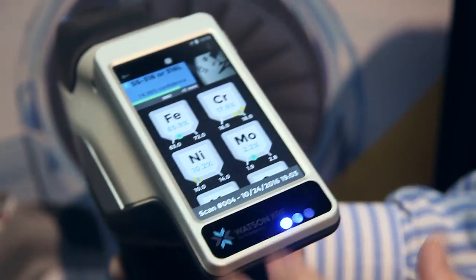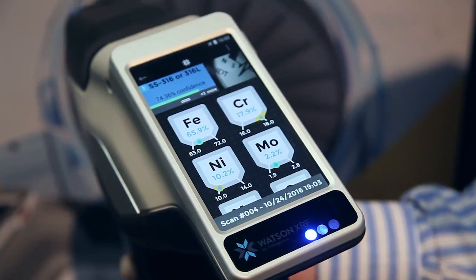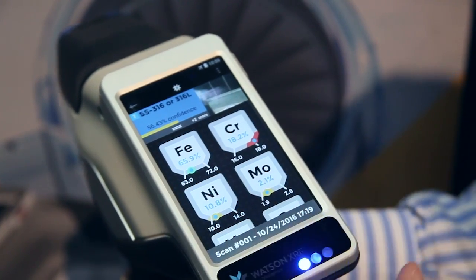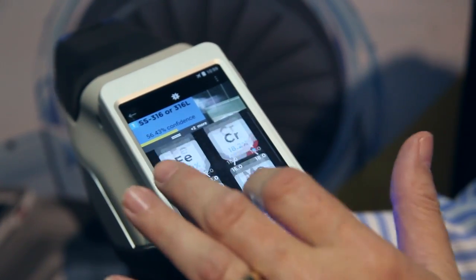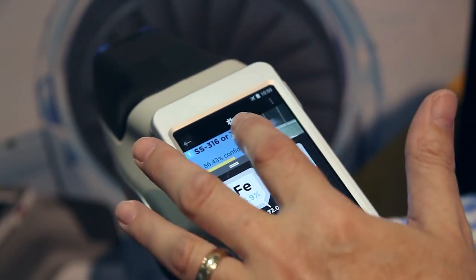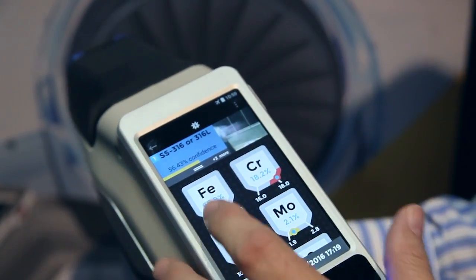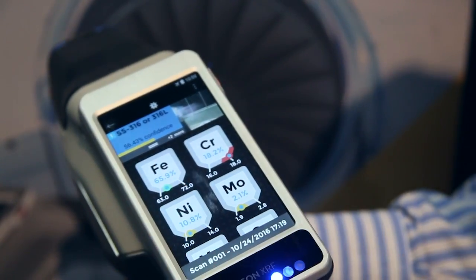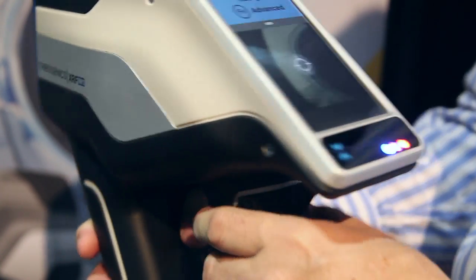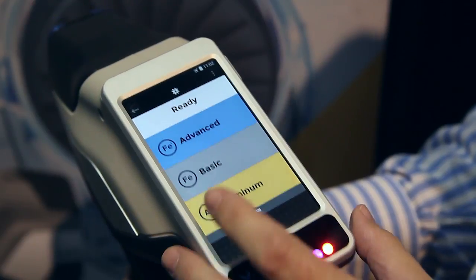Watson has a very easy to use interface. If you're familiar with a mobile phone, then you'll be familiar with swiping and scrolling up and down on the touch interface. As you can see, Watson presents the grade of metal here in the top box and then the elements of each metal down below. To enter scan mode, a simple pull of the trigger and you can activate any of three modes that we have.